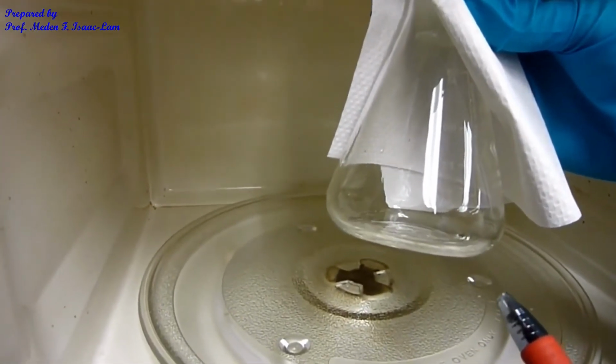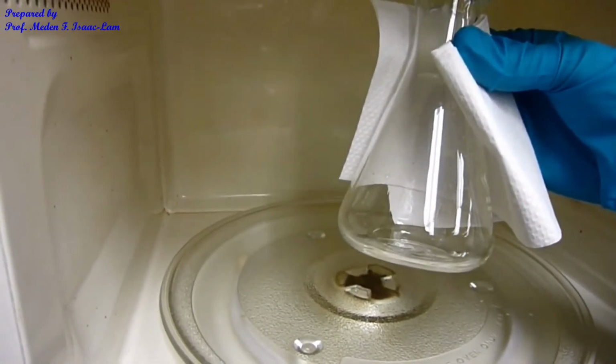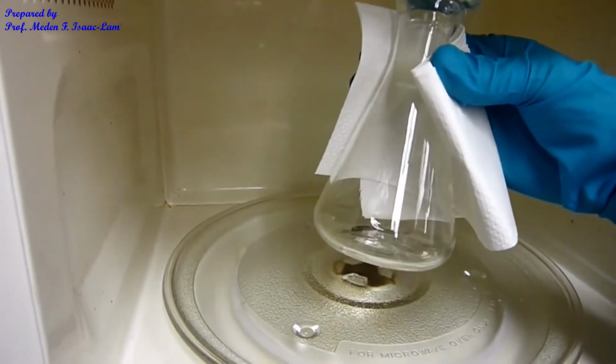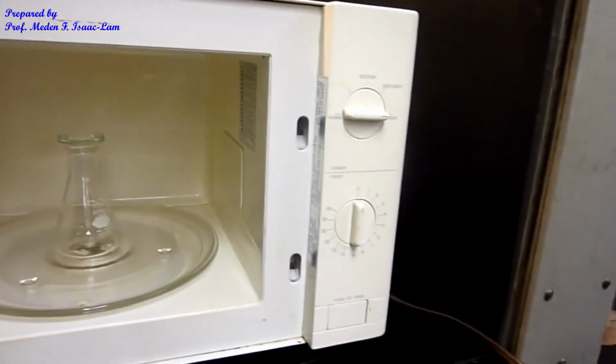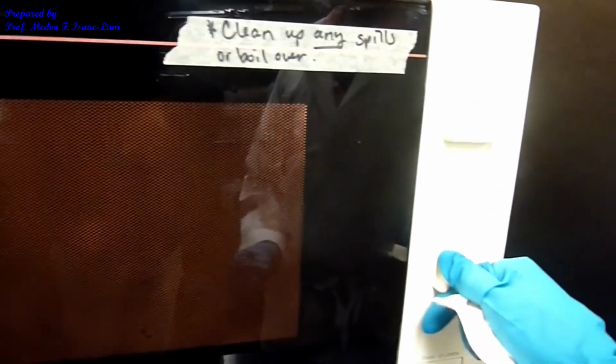So I'm gonna microwave it again for another 5 minutes, but I will do first 3 minutes, and then I let it cool, and then another 2 minutes. So right now it melted. So microwave again. I'll set it to 3 minutes. So I close the microwave, and again set to 3 minutes.